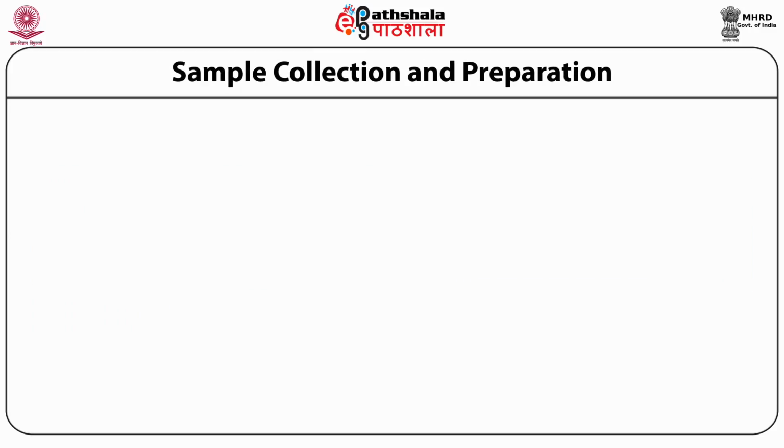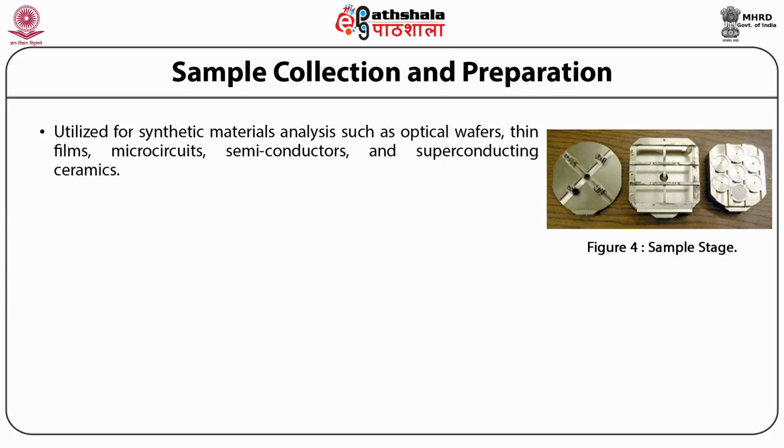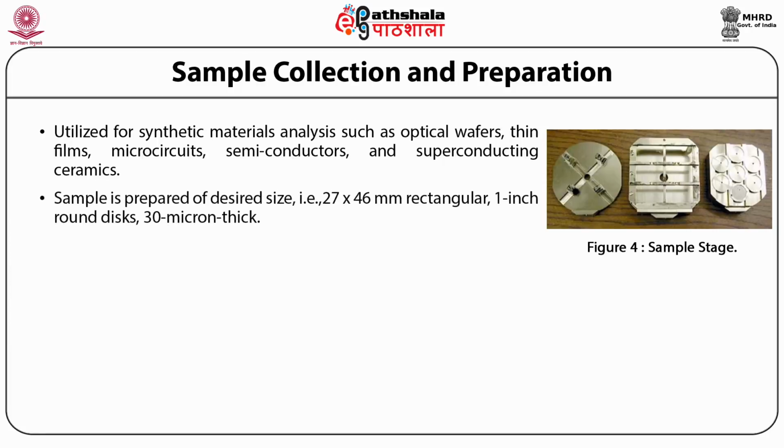We next move on to study the sample collection and preparation. It is utilized for synthetic material analysis such as optical wafers, thin films, microcircuits, semiconductors, and superconducting ceramics. Secondly, sample is prepared of desired size, that is 27 by 46 mm rectangular, 1-inch round disc, 30 microns thick.